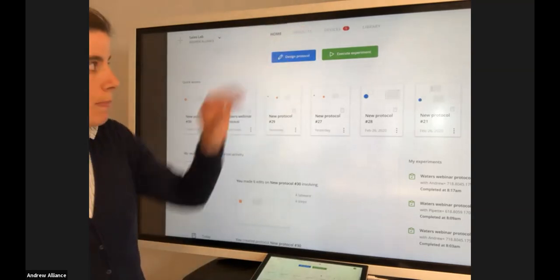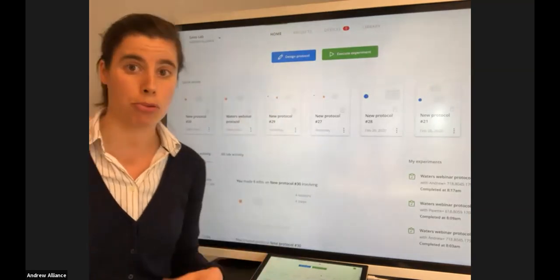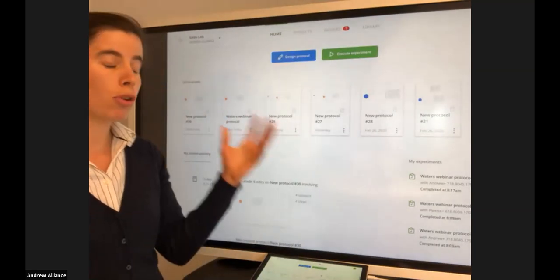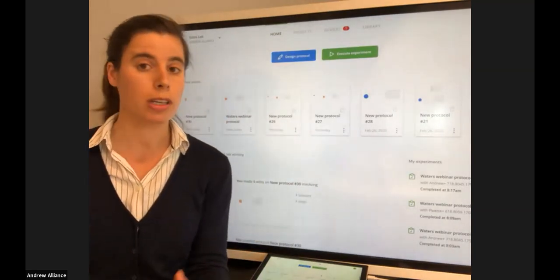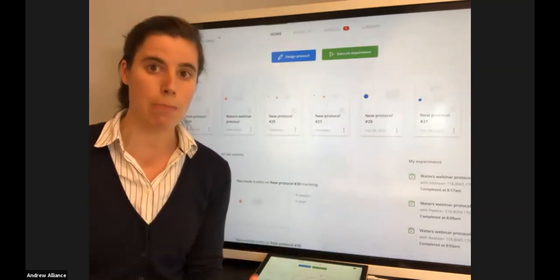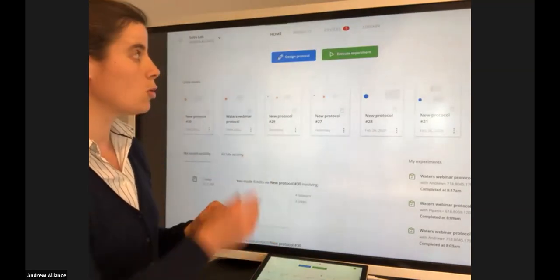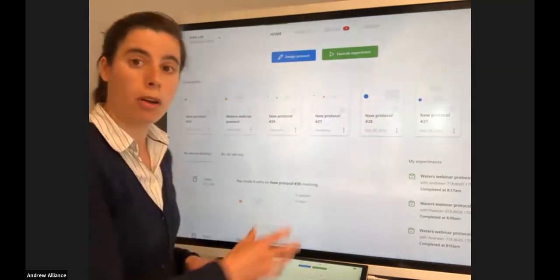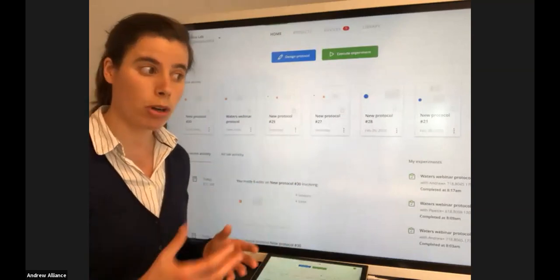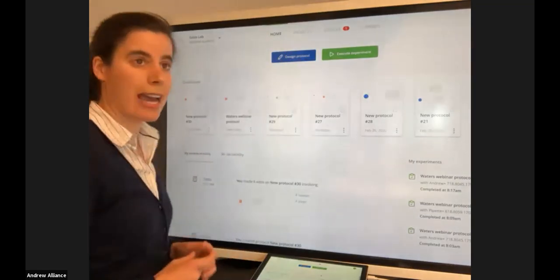At the heart, OneLab is really designed for two main things. The first one is designing a protocol. The second one is the execution of your experiments. A protocol is really the method you're looking to execute, while the experiment is when you take this method, you go to your lab bench and you start producing real-life results. So without further ado, what I want to do with you guys together is make a protocol from scratch. We'll run it on the Andrew Plus robot, and then we'll run the same one on the Smart Stand Pipette Plus as well. So we're going to be clicking on Design a Protocol.